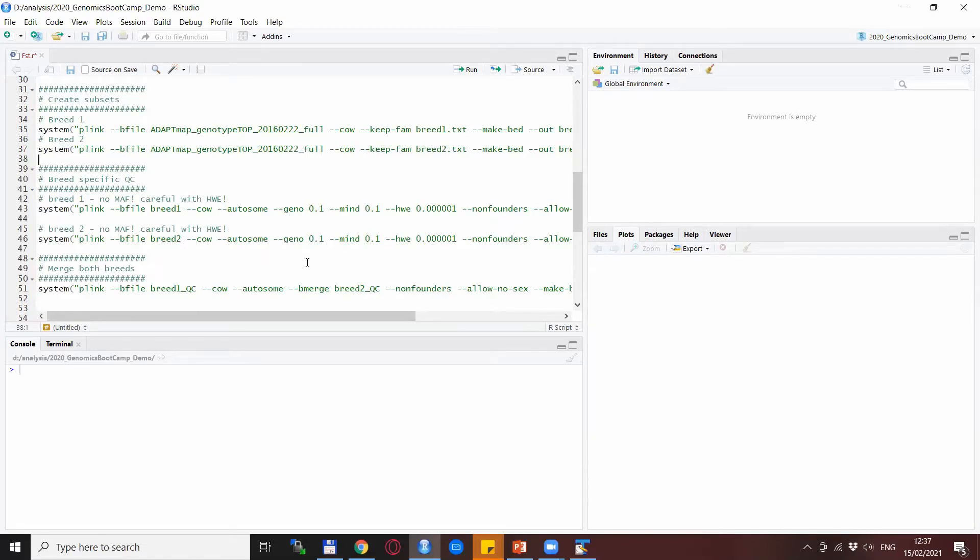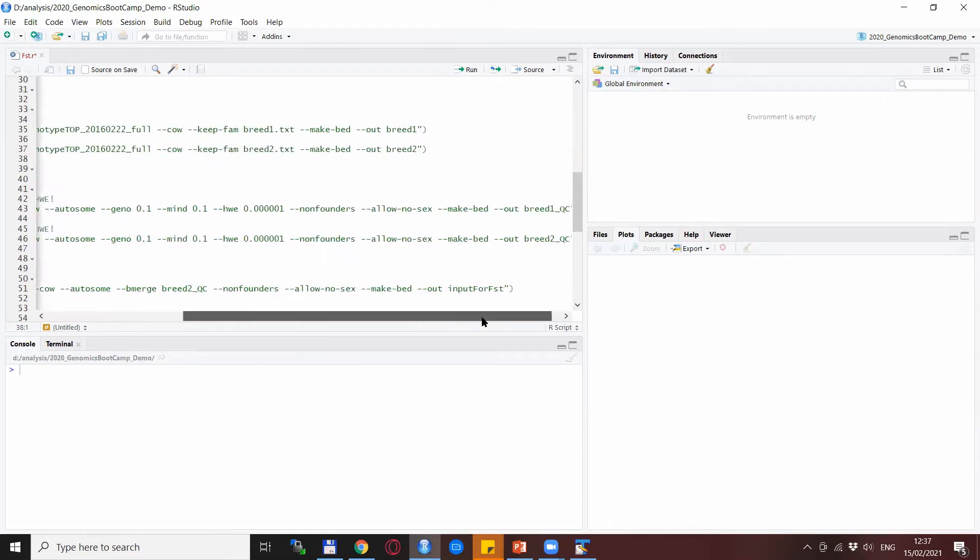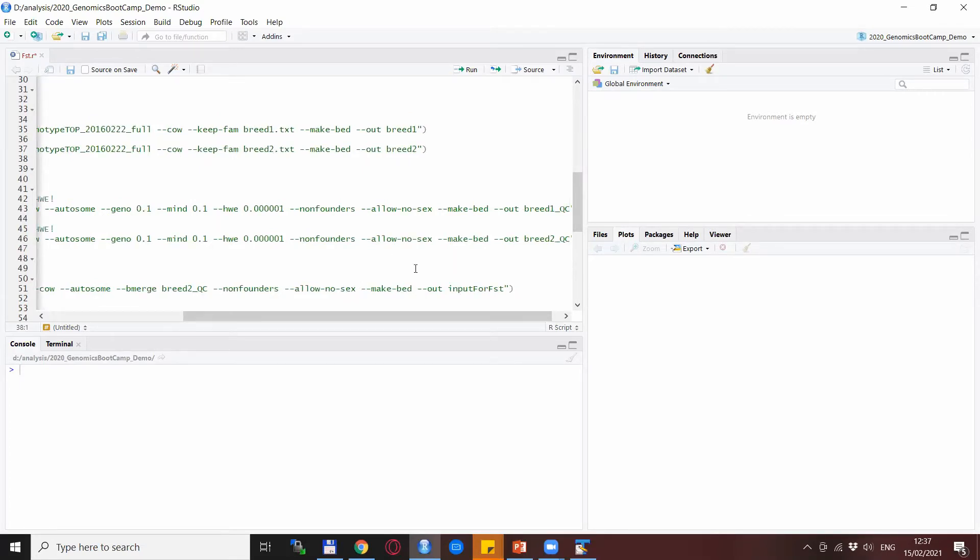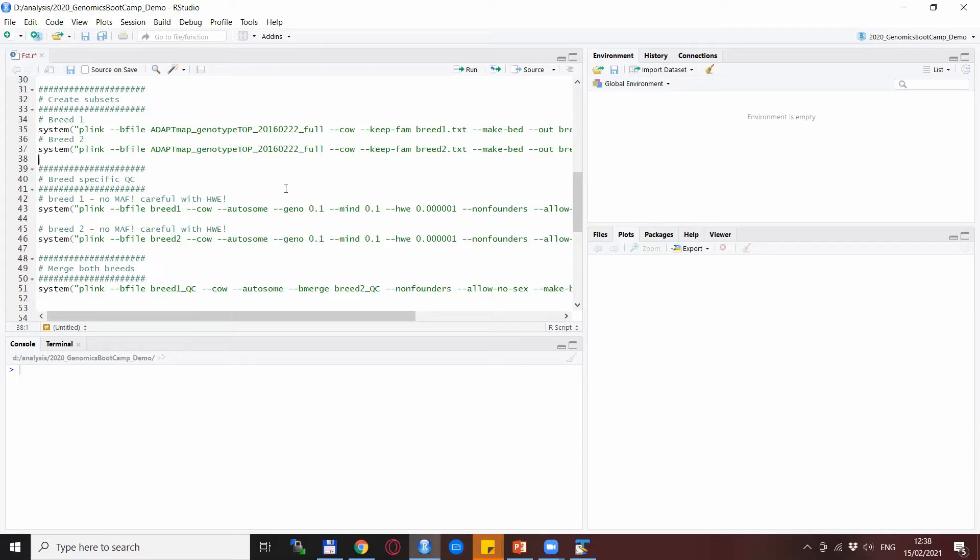We use --bmerge because we are dealing with binary PED files, and at the end we make a new PED file with the name input for FST. With a lot of explanation, I forgot to actually run the script lines so that you can see what is happening, so I will do that now and we will follow up and highlight the most important things that happen.